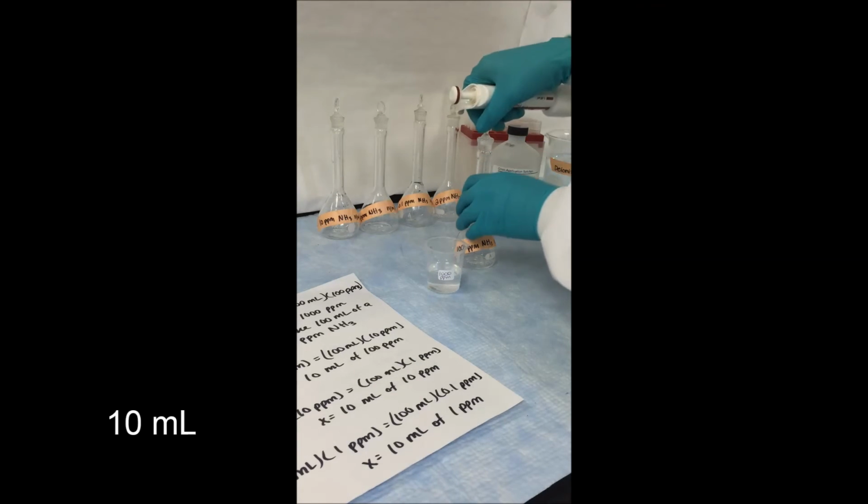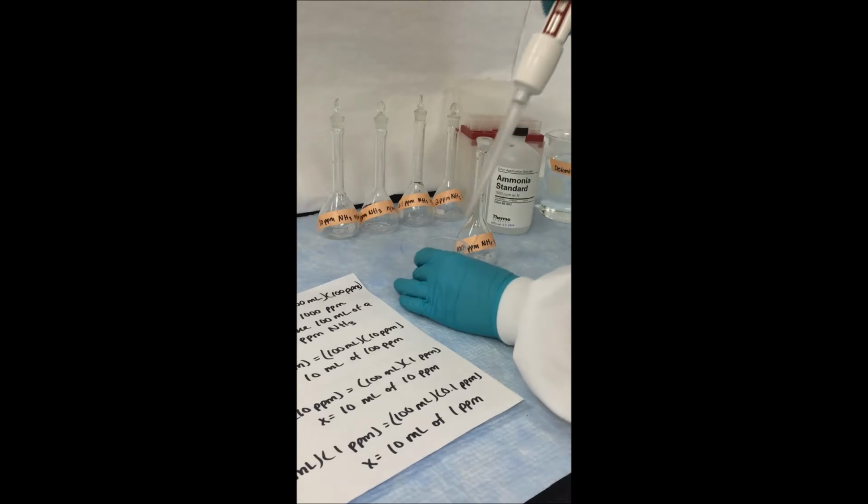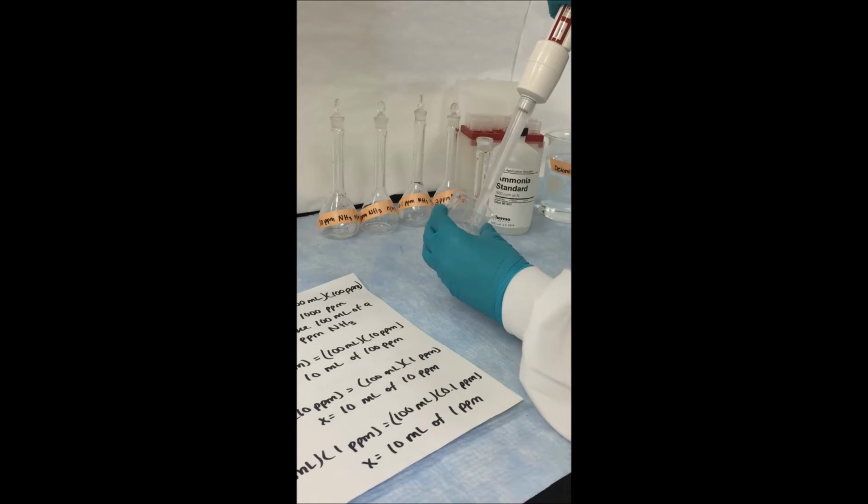You do not want to draw directly from the bottle to avoid possible sources of contamination. Using a 10 milliliter pipetter, we're going to transfer 10 milliliters of that concentrated solution into our clean glassware.